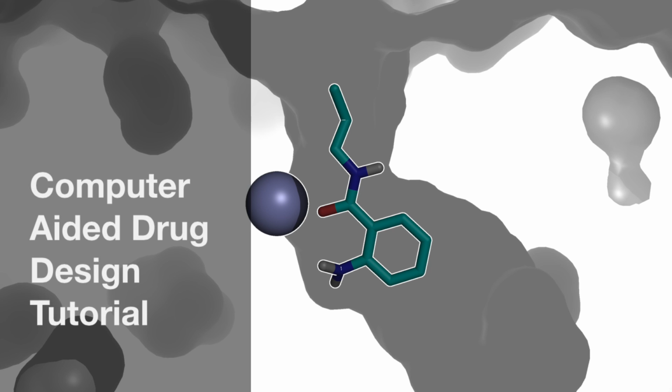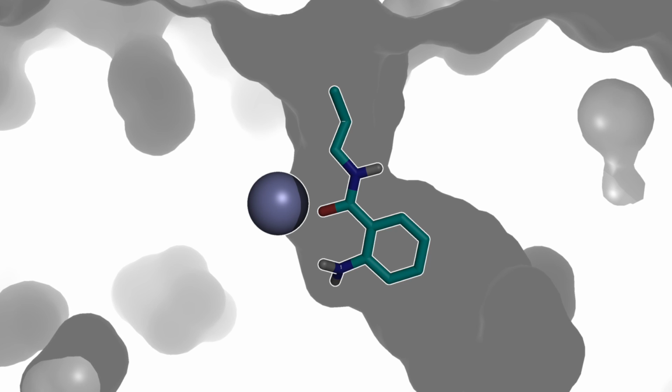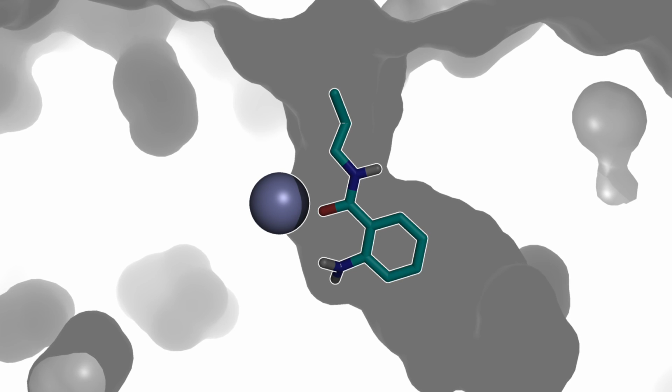Hi, and welcome to the tutorial that goes along with our computer-aided drug design laboratory experience. In this tutorial, I'm going to show you how to use the myriad different pieces of software that work together to accomplish the drug discovery experience that you've read about in our journal article.